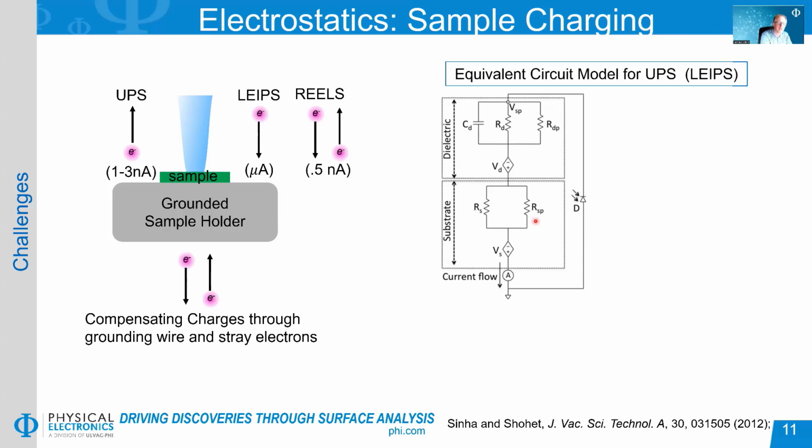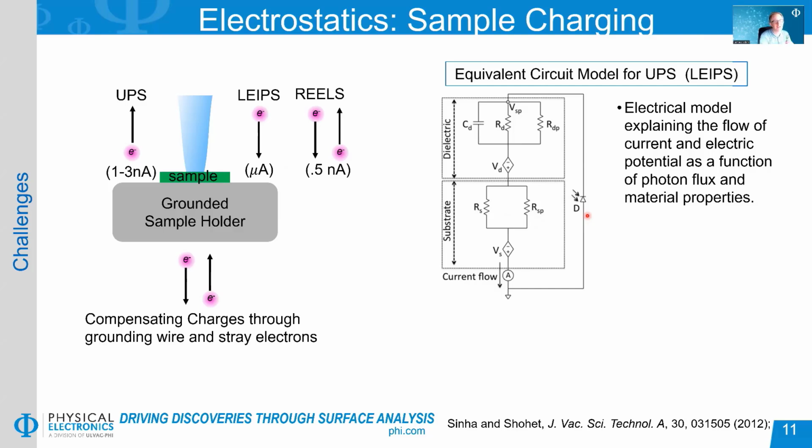Okay, and they have a resistance in series and for the surface potential of the substrate. That creates a voltage at the dielectric and substrate interface. There's some capacitance to the dielectric. There's resistance between them, and then there's a resistance that's due to the surface dipole.